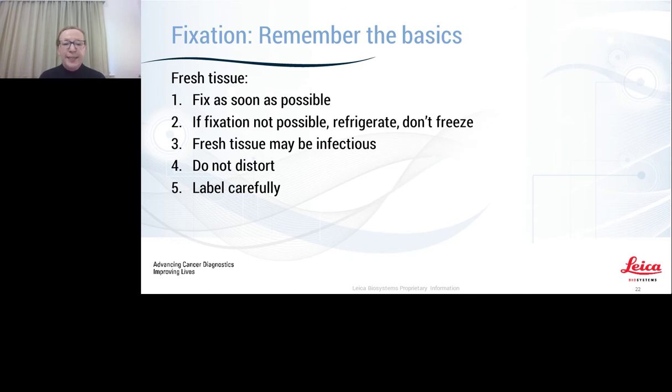So just remember the basics. With fresh tissue, fix it as soon as possible. If fixation isn't possible, refrigerate, but don't freeze. Freezing can cause an artifact, or ice crystal artifact. Fresh tissue may be infectious. Do not distort, and label very carefully.